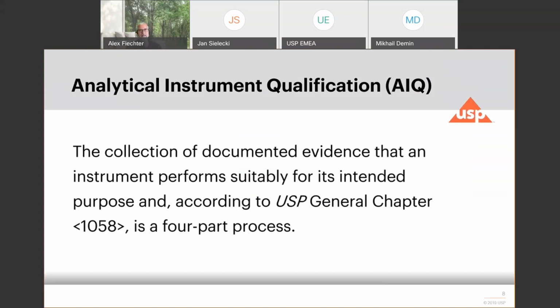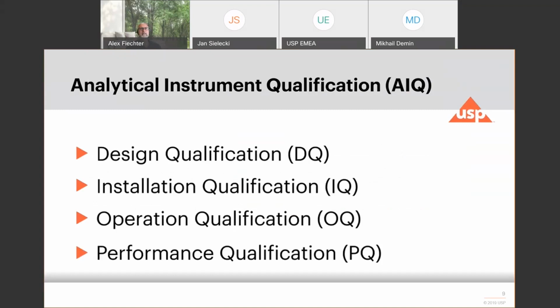It's mandatory to do that test according to 711, and 711 also describes the qualification of the instrument and also calls for the system suitability or the performance verification test, PVT. But the analytical instrument qualification starts out with the DQ, design qualification. Installation qualification is next.